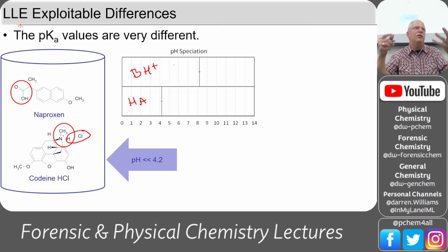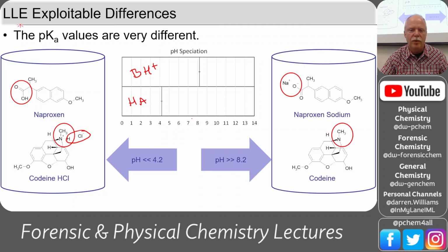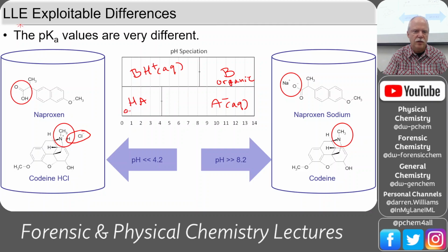And I mean, you don't have to worry about the HCl. As soon as it goes into solution, it keeps the H plus and the Cl goes somewhere else. Water takes it away. So it's really focusing on the substances, not the counter ion, the HCl. The Cl minus is floating around in water. Okay, and then if you wanted to go above 8.2, now you've deprotonated the base. And so this is just B, and this is the A minus. And this is aqueous. So all of the ionized pieces are aqueous. And this is in the organic phase, and this would be in the organic phase.